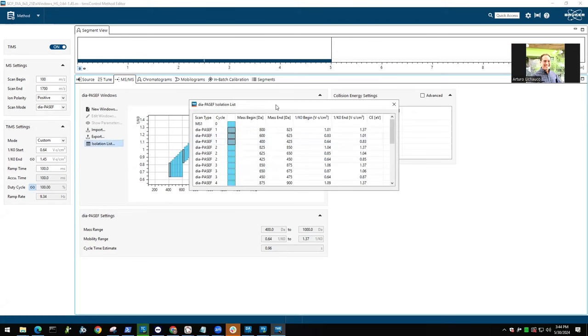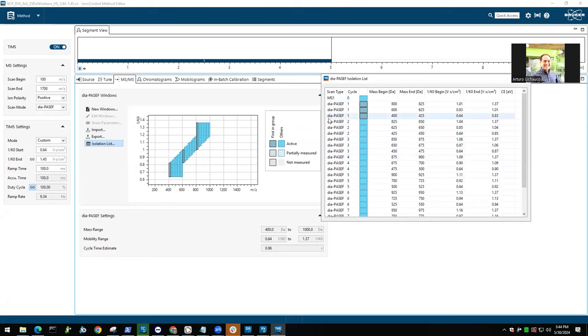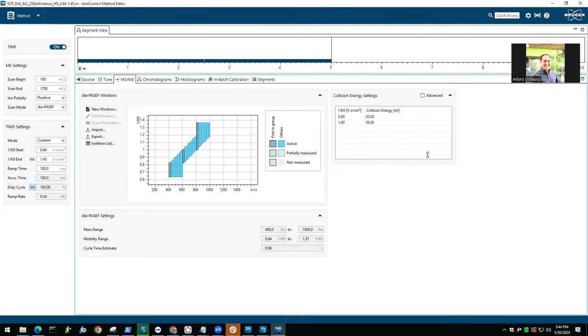So when we go to this isolation list again, those would be acquired in the same ramp. Right? We do 8 ramps or 9 ramps in total. The first one is the MS1, and then we do 3 or 2 window switches and analyze those in one ramp. And we ramp again, analyze this range, next ramp, so on, and then we start over again. So we cover 400 to 1000 m/z within this scheme, and that's how we get to this cycle time here.